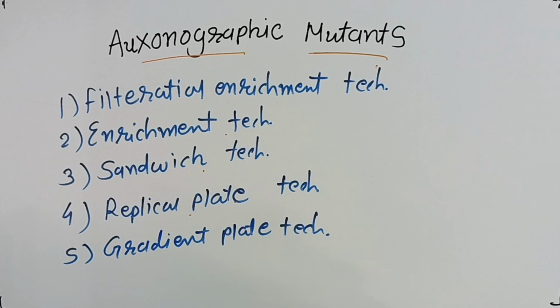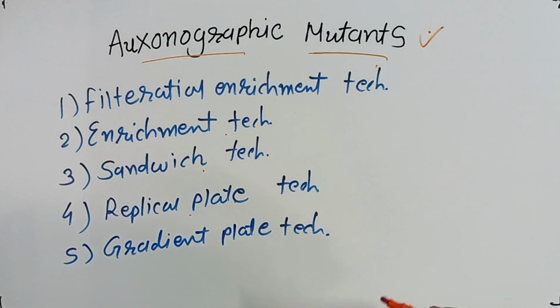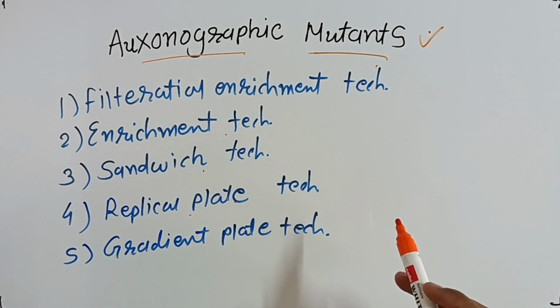In this video lecture, we are going to discuss an exciting and interesting topic of microbiology, that is auxanographic mutants. So what are the auxanographic mutants and what are the techniques for isolation of these auxanographic mutants? This is our today's lecture topic.